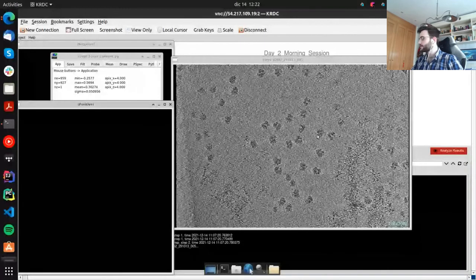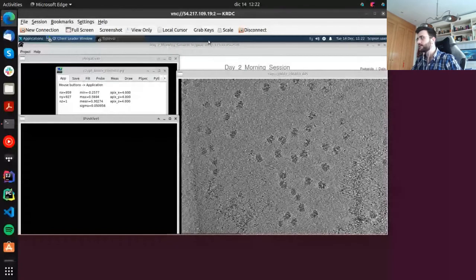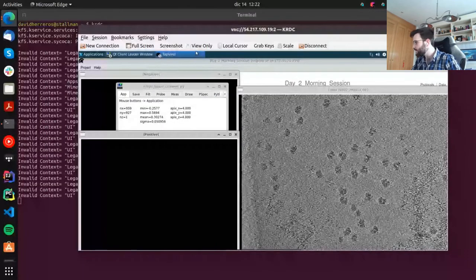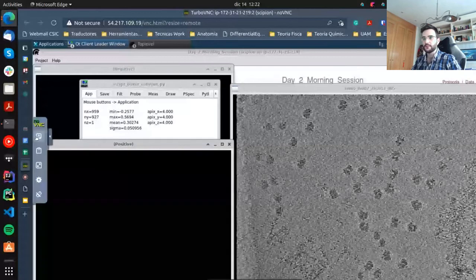And for noVNC, I can try to connect. Just 1 second. Okay, I don't know why this window minimized. Can you see the noVNC window now? It's kind of big for me, but I guess Pablo refers to this place, right, Pablo? Because I have not used noVNC, but I guess it should be here, in the show extra keys, probably.